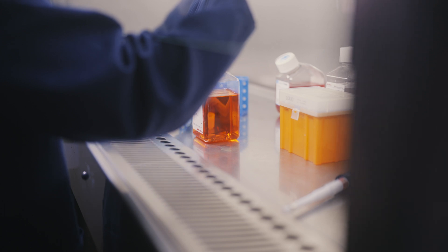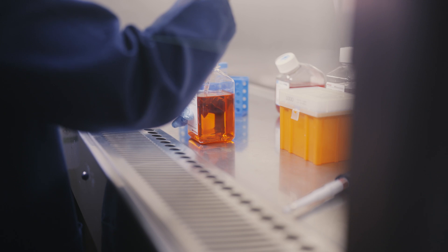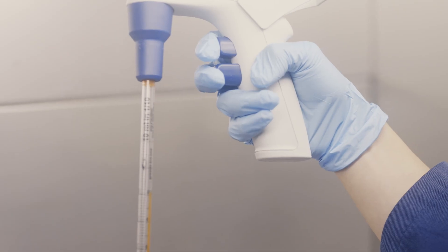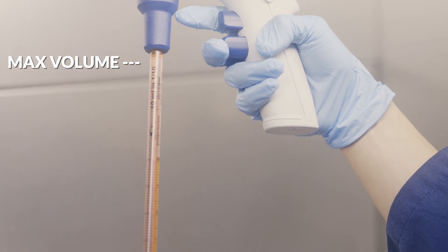In this first example, we are pipetting some media. Given the volume of media needed, a motorized pipette controller is used with a 10 milliliter single-use pipette. I'll give you a moment to watch the clip — write down all the mistakes you can spot. The main mistake here is over-pipetting. Each pipette tip has a maximum volume and there are different sizes available. If you use the motorized pipette controller to pipette beyond this maximum volume, the liquid will contaminate the actual pipette controller. The top of each pipette has a filter to prevent the liquid from entering into the pipette controller, but this is not a 100% foolproof fail-safe.